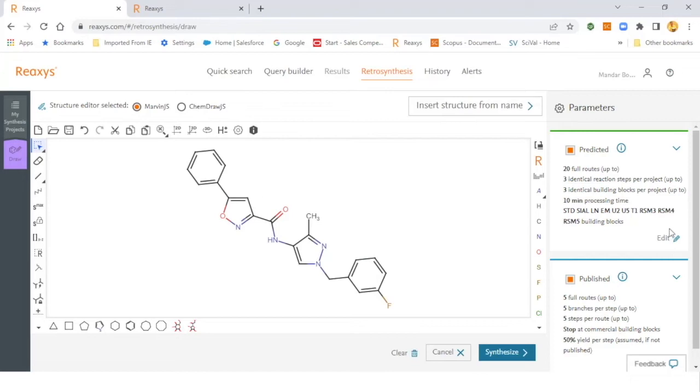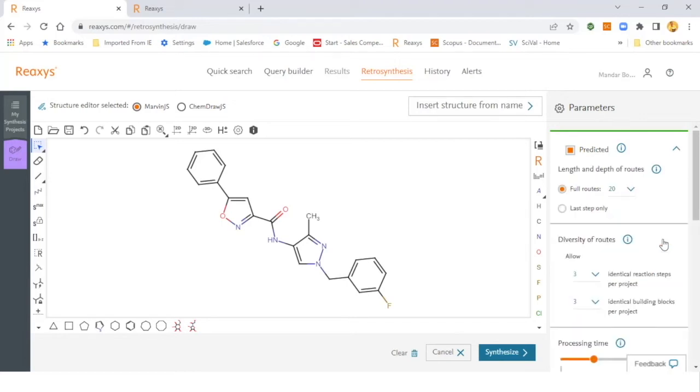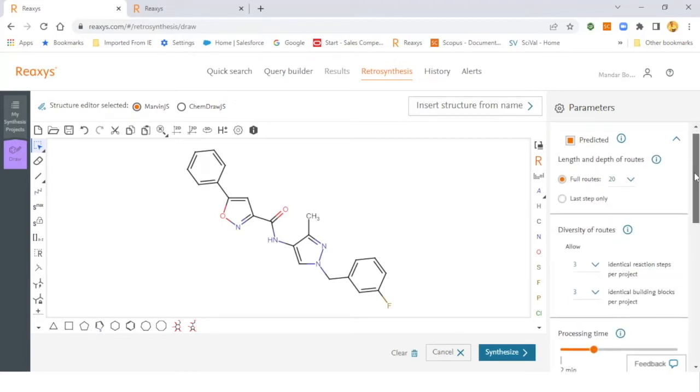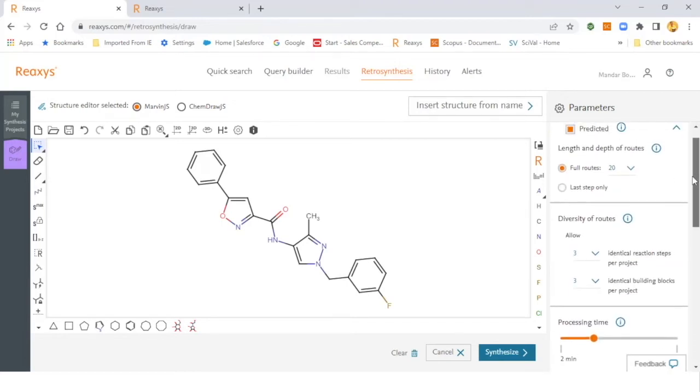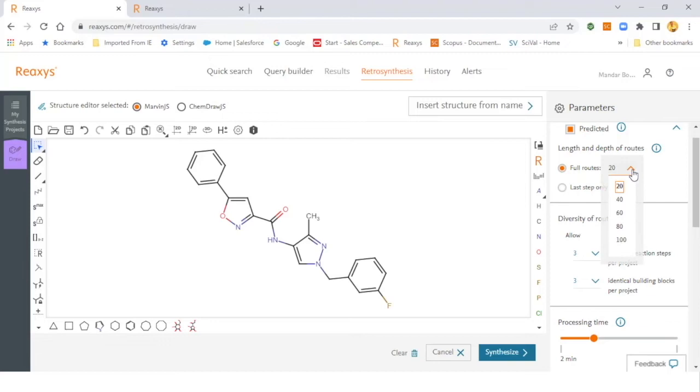You can click Edit and once you click Edit, you have the option to choose either the Retrosynthesis way with the last step option only, wherein you can go step by step backwards toward the starting materials, or you can choose the full routes. You have options to get or receive more than 100 routes at a time.